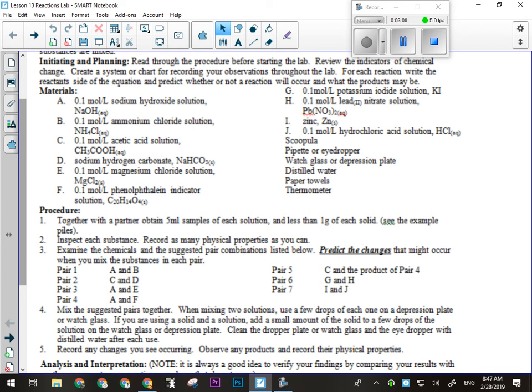All right. So one of those things we're kind of passively controlling, same as we were in the last lab, is the room temperature. Temperature affects rate of reaction, and that's going to be the same throughout the entire lab, all right? We could also say that other environmental factors, atmospheric pressure, any environmental factors that you can think of can be controlled variables for this experiment, okay?